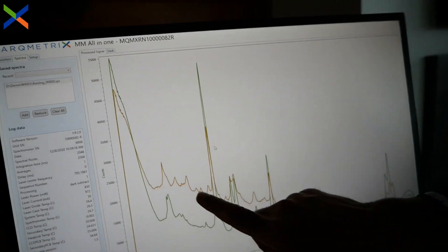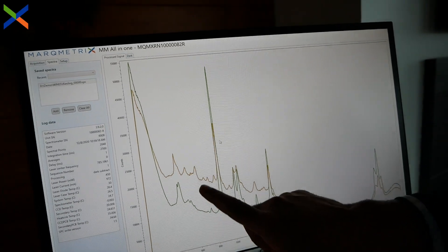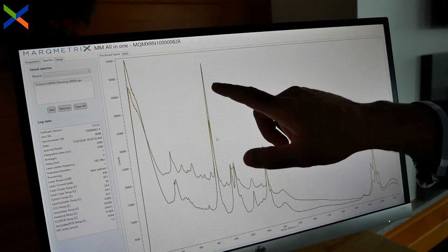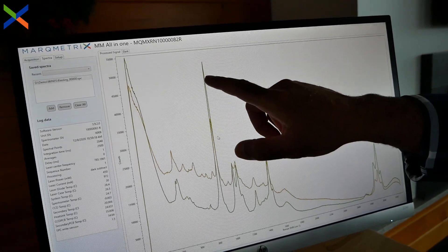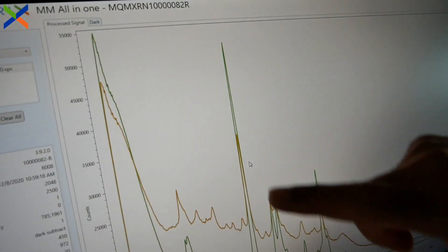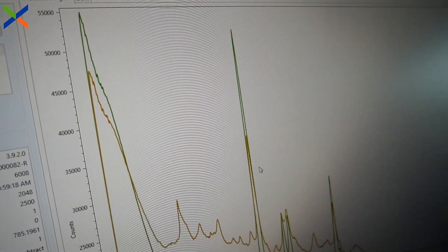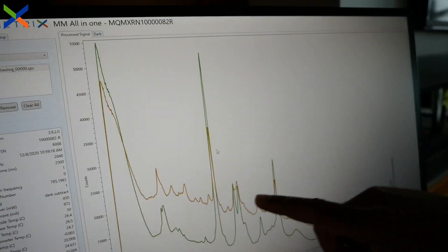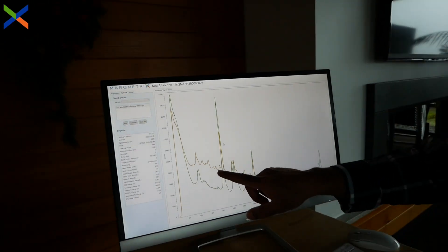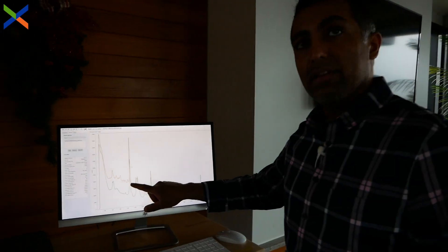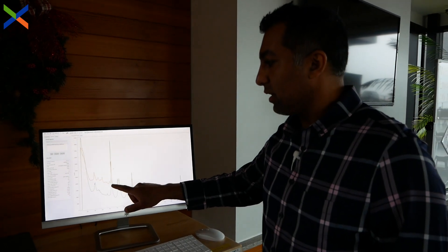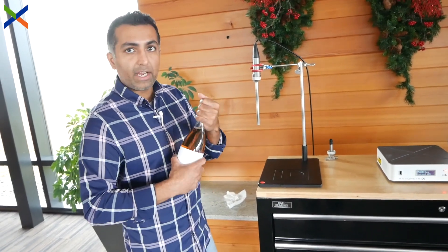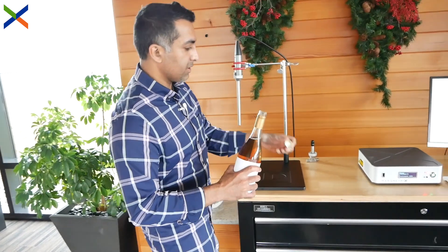The peaks that are missing are the ones coming from the sugars in the Riesling. From what I can see, there is a lot more alcohol in the sake than in the Riesling, and that's most likely because of the unfermented sugars that weren't allowed to ferment all the way through, giving the sake a higher alcohol content. Next up, I have a bottle of rosé.